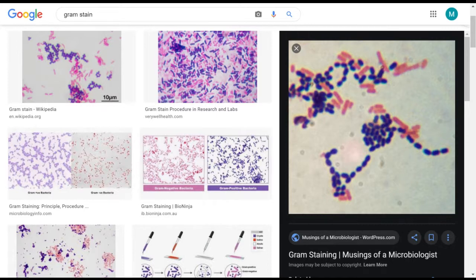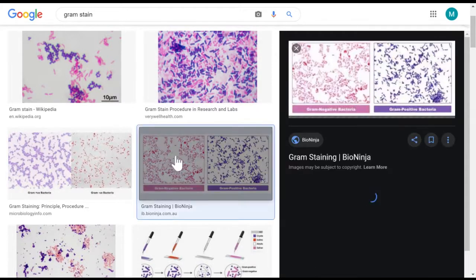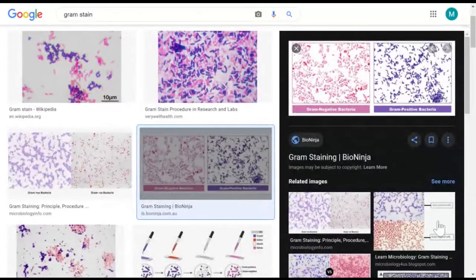Let's put it this way. They're classified as gram-positive cocci. Okay, so yes, you could argue one thing or another, but when it boils down to it, they're classified as gram-positive cocci. And that is typical of the gram-positive that makes chains. The good thing about the rods is that most of the time, the rods are obvious rods. Now, the rods that are Cocobacillus, those can be tricky. No question about it. Let me see if I can find.